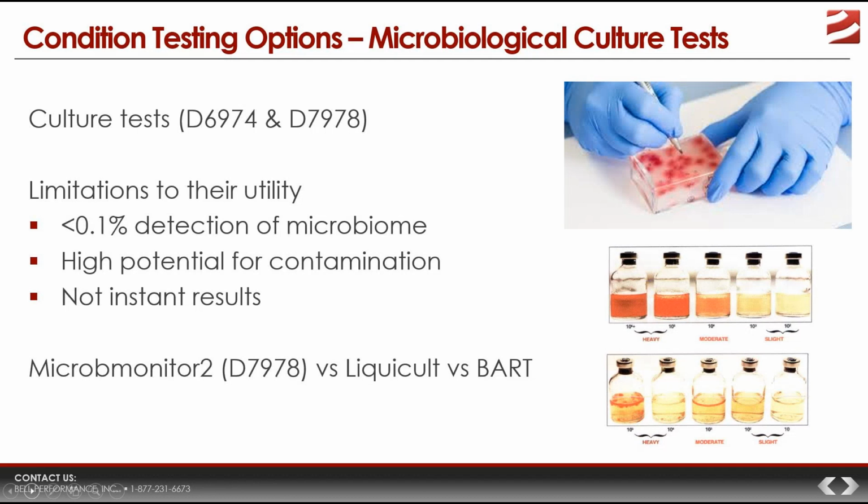There are three classes of microbe detection tests that are most widely in use out in the field. Now, this doesn't count highly specialized genomic tests that cost thousands of dollars and are only done in a specialized genetics lab.